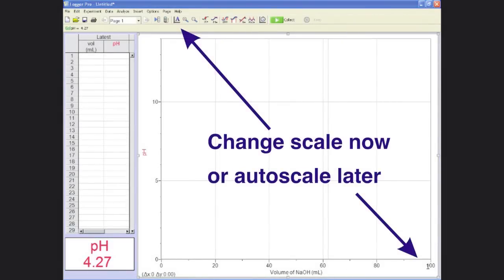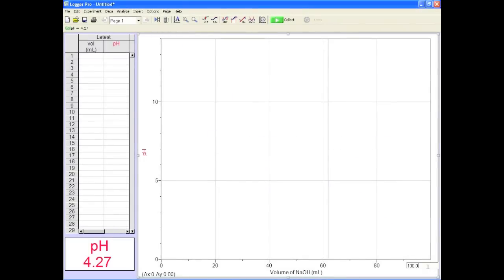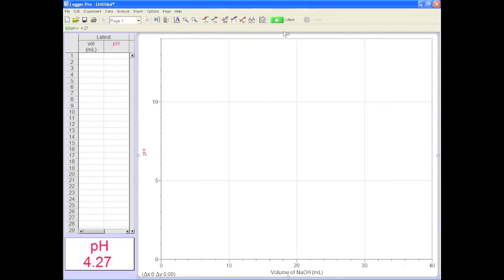If you want, you can change the scale on the x axis now or you can auto scale later. It's sweet to see your results scaled as you go, but I'm not gonna force it on you. Alright, now it's go time.